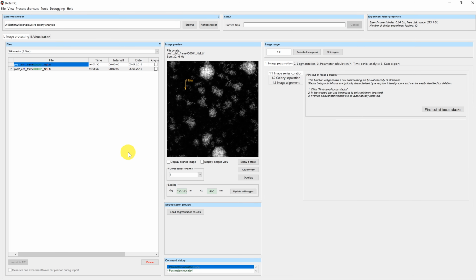Welcome to this BiofilmQ tutorial. My name is Hannah and today we will have a look at how to analyze microcolonies.